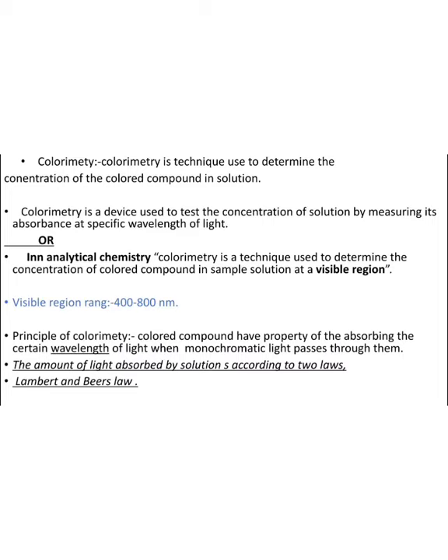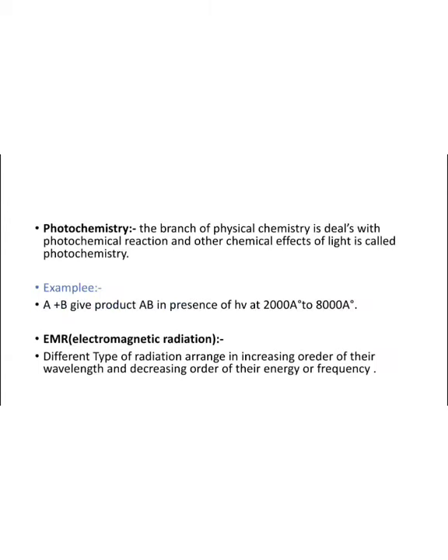In this case, we prepare one homogeneous absorbing medium. When we pass monochromatic light, the absorbing medium absorbs the light, and this depends on Lambert's and Beer's law.